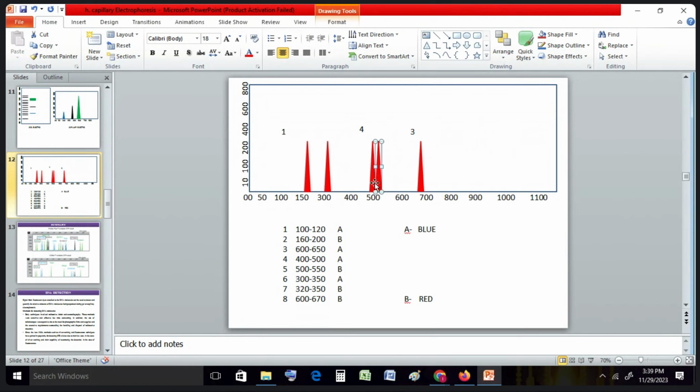Two peaks close together, say 15 and 14, or 15 and 10 repeats together. So for 15 you have one peak or one band. In normal electrophoresis it is a band; in this case it is a peak. For 15 you have one band or peak, and for 10 you have another band and another peak. So this result is a heterozygous result, and this one also shows a single peak, so it is maybe a homozygous result.